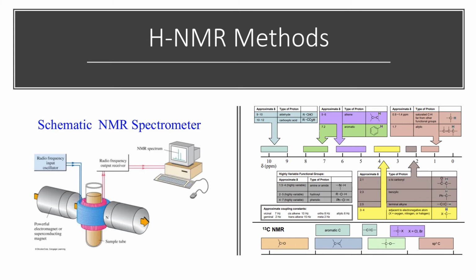The methods for proton NMR are as follows. First, you obtain an unknown solution, then add roughly 0.5 milliliters of CDCl3. Then you add 0.5 milliliters of the unknown solution. These two substances are then mixed together and placed in an NMR tube. This tube was then placed in an NMR reader. The results were computed and printed.